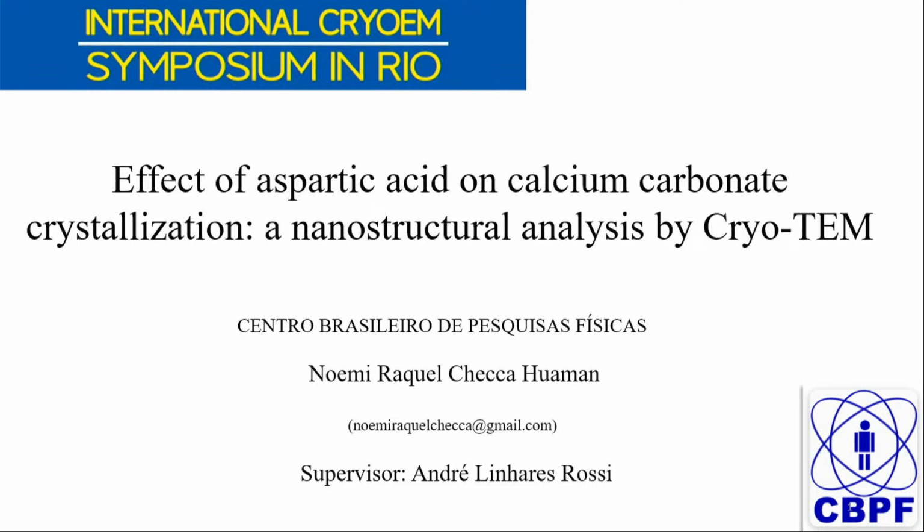The presentation is titled: effect of aspartic acid on calcium carbonate crystallization, nanostructural analysis by Cryo-TEM.